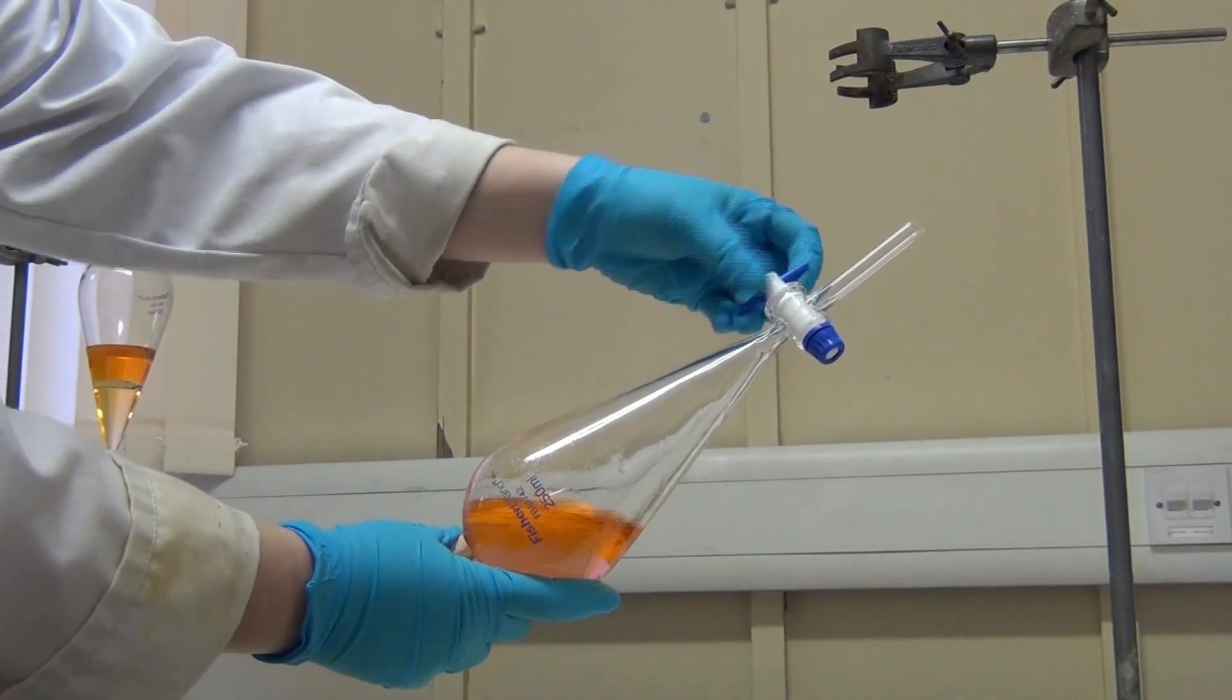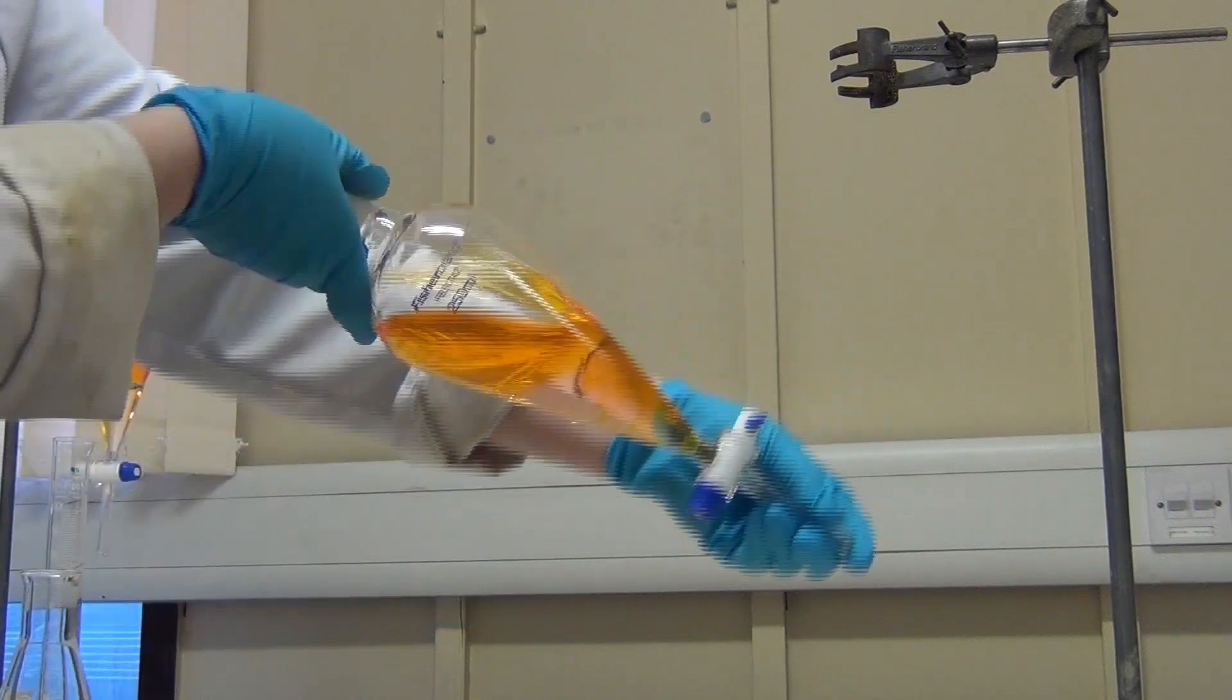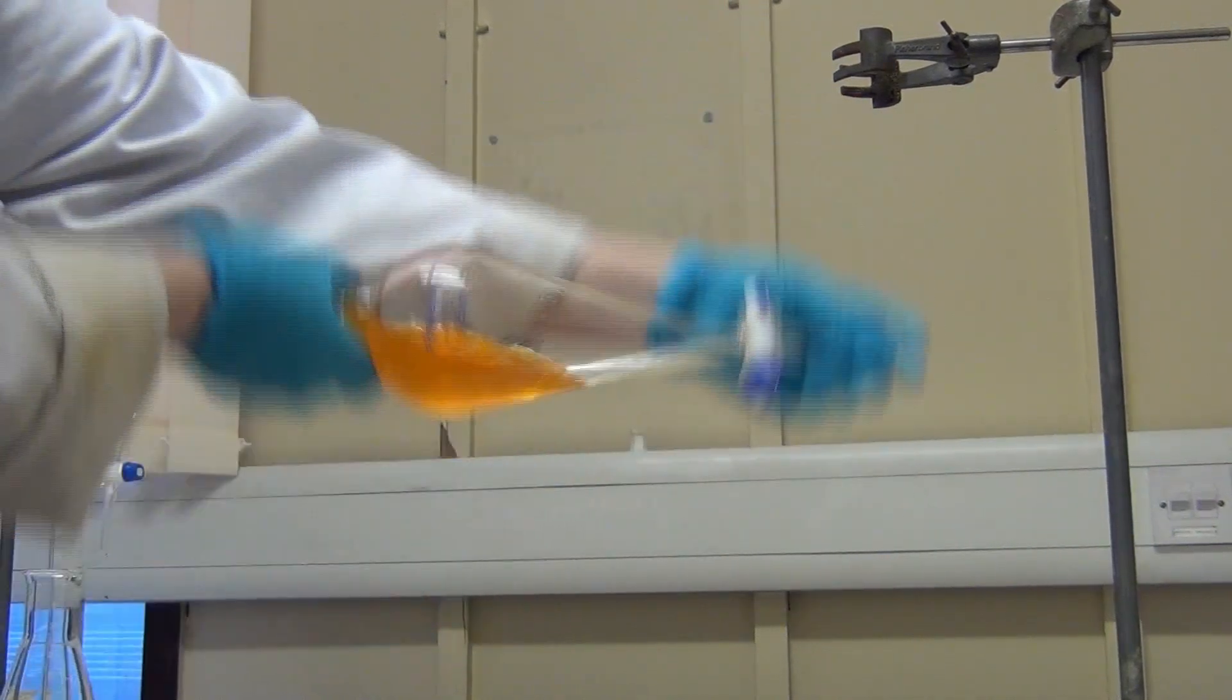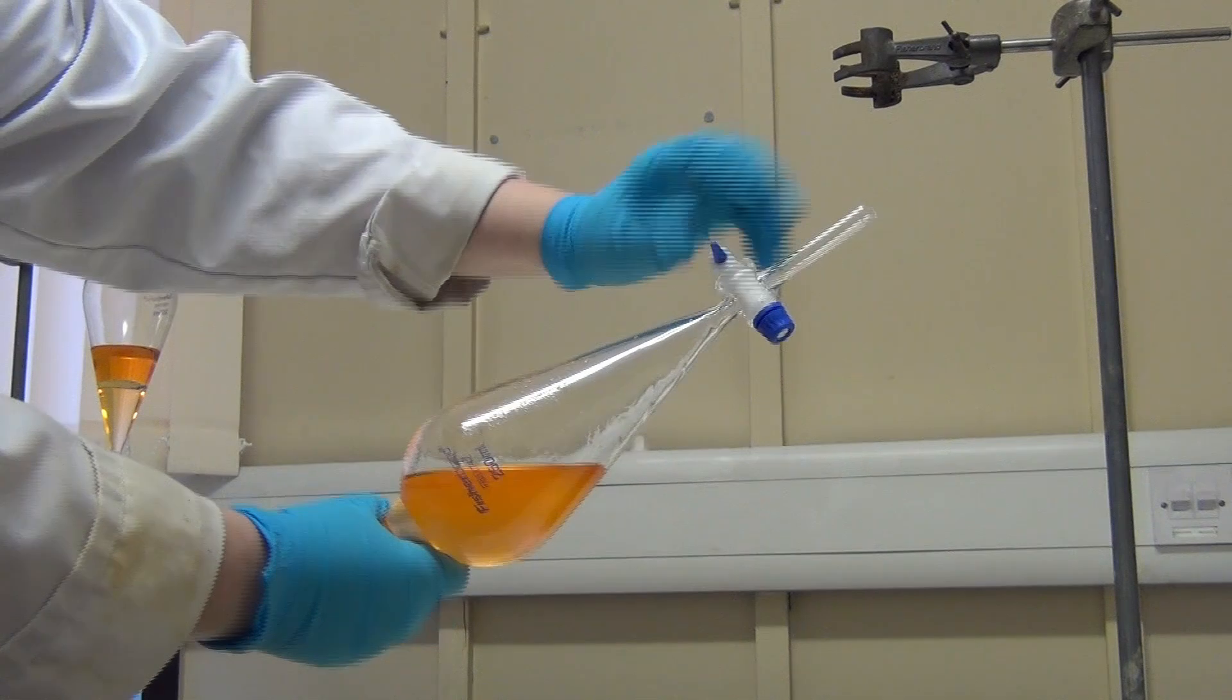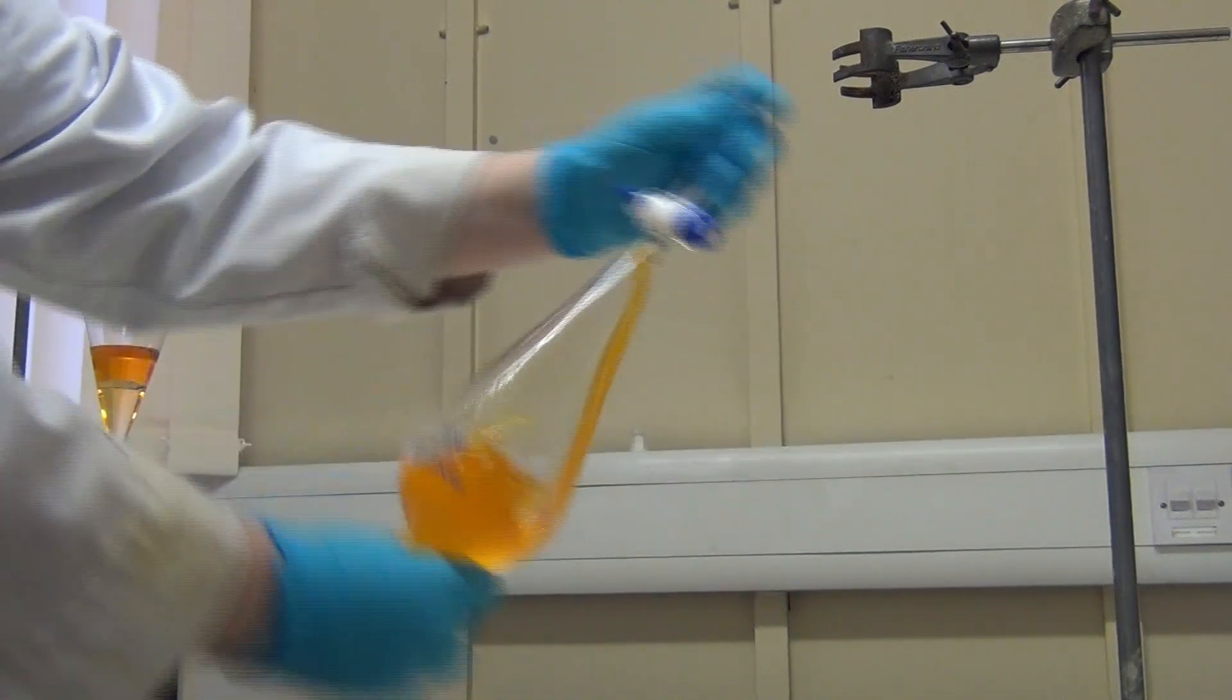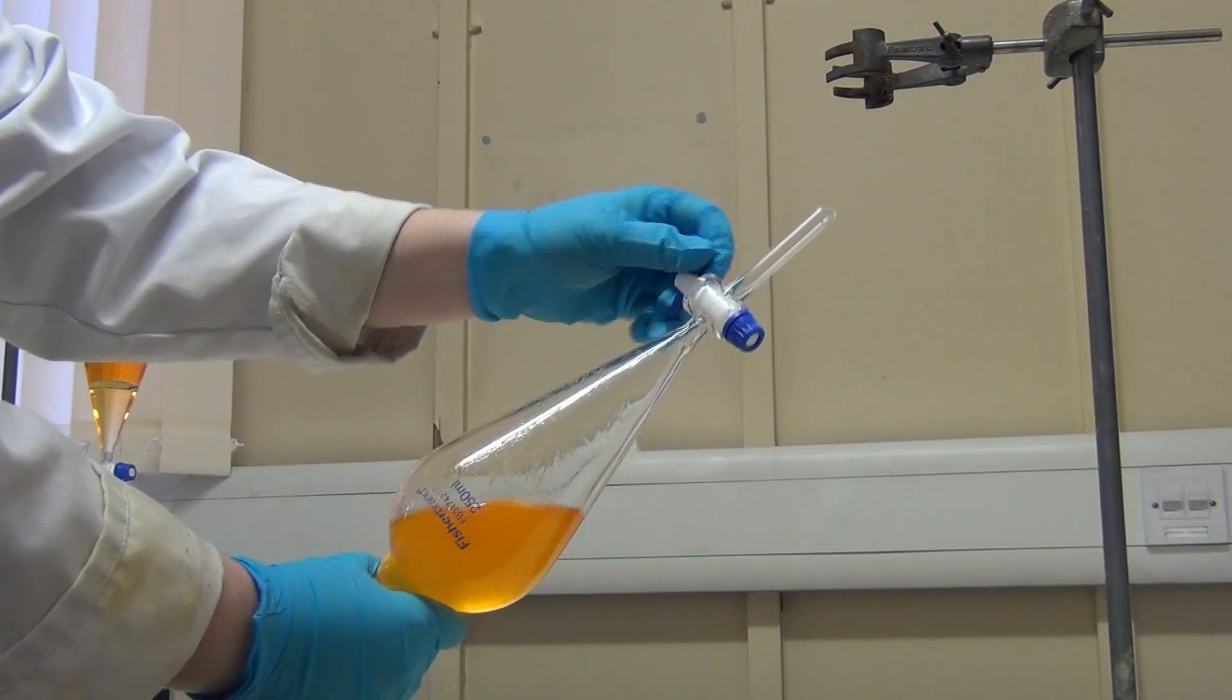To begin with, you should remove the funnel from the clamp or ring, holding it securely with both hands, and then turn the funnel upside down. When upside down, open the tap to release the pressure that may have built up during the mixing.